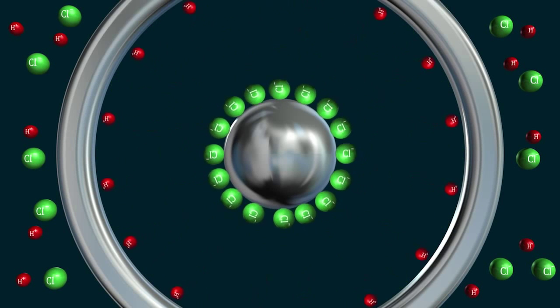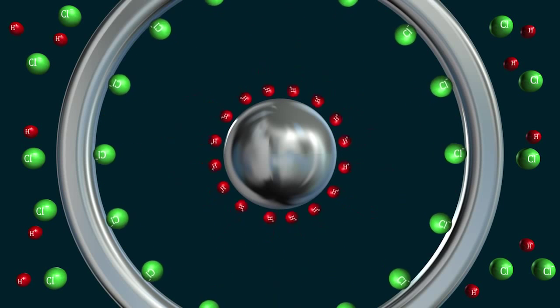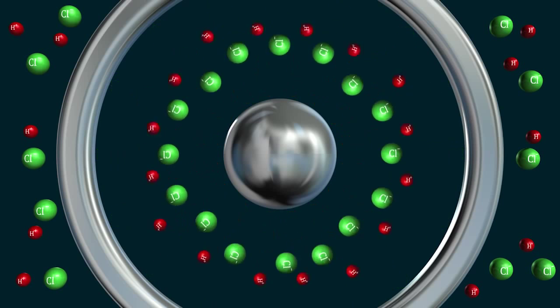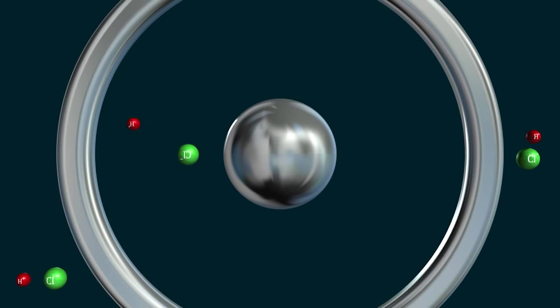A 10% acid, for example, is a very good conductor because it contains many ions that transport the charge. In contrast to this, pure and ultra-pure water are bad conductors because they contain only few ions.